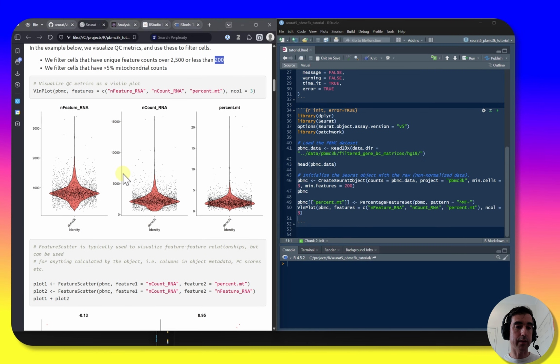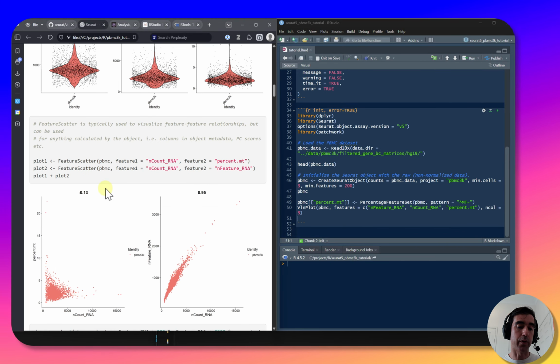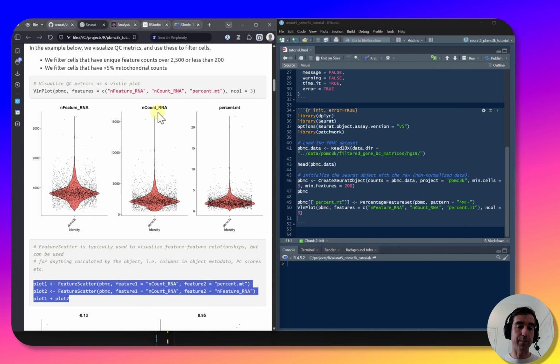But essentially, these three charts were generated, and based on these three charts, plus the criteria of somebody with experience in this field, it would be possible to define some cutoff points. They also plotted some of these elements together with each other.